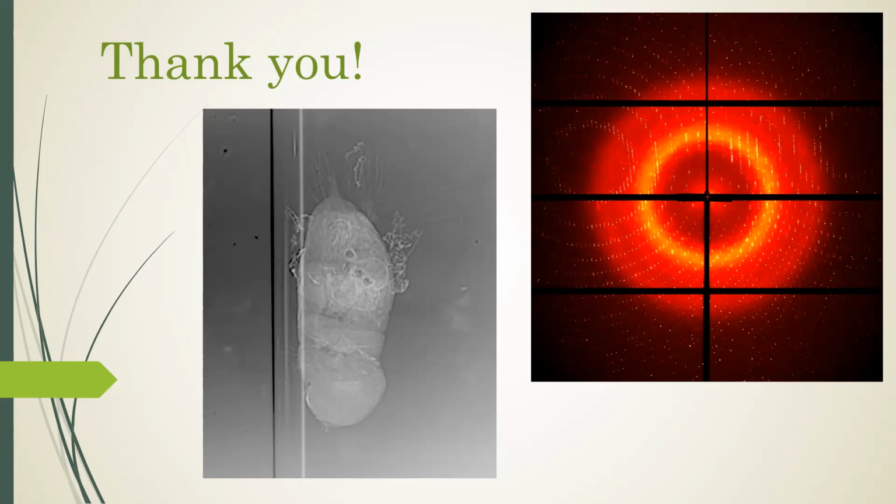I'd be interested in having the source code of DOZOR. DOZOR, that's very much available. Gleb and Sasha give it to everybody who asks, but it is in Fortran, so you have to understand what's happening. They give both the executable and the source code. And Martin Savko for sure, and the other beamline scientists at Soleil, they have also the source code.